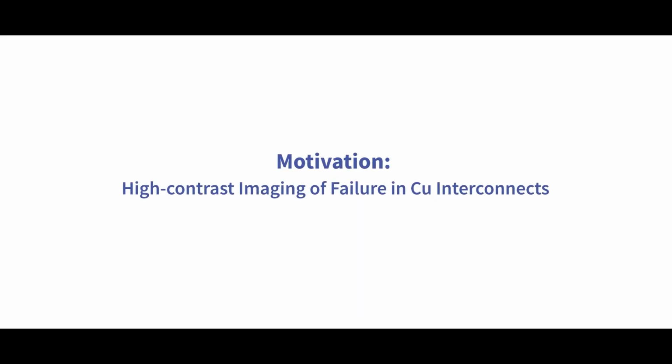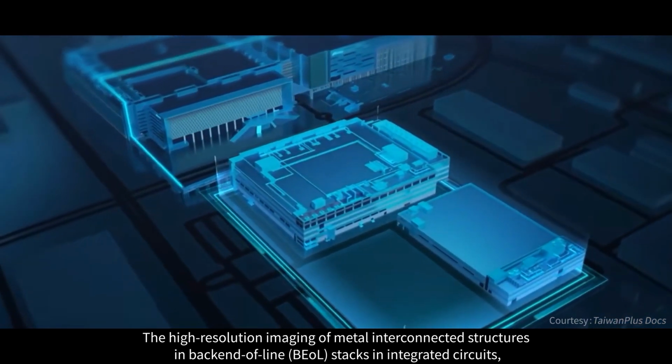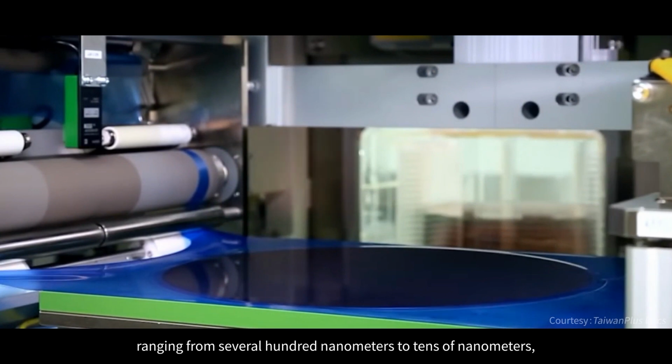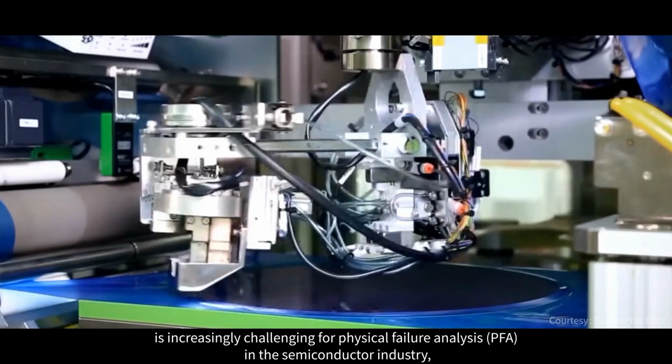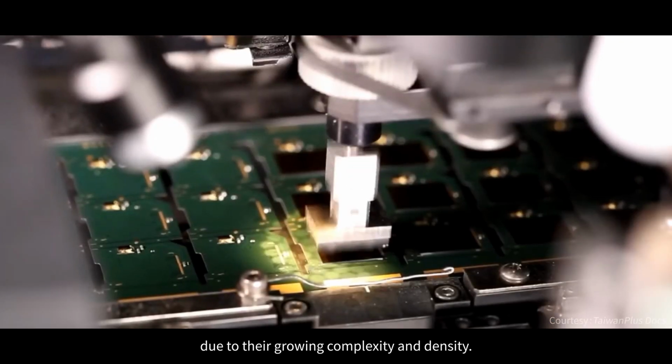Motivation: high-contrast imaging of failure in copper interconnects. The high-resolution imaging of metal interconnected structures in backend-of-line stacks in integrated circuits, ranging from several hundred nanometers to tens of nanometers, is increasingly challenging for physical failure analysis in the semiconductor industry, due to their growing complexity and density.